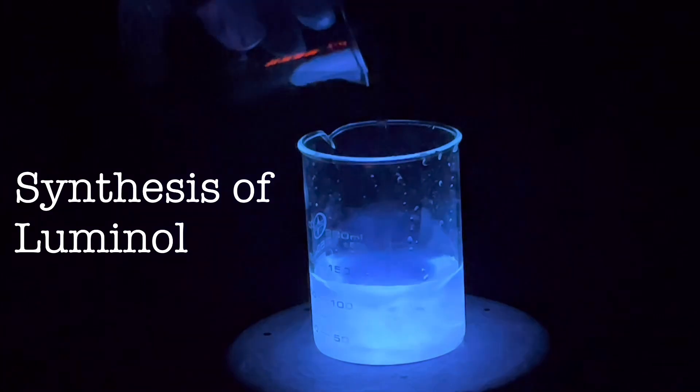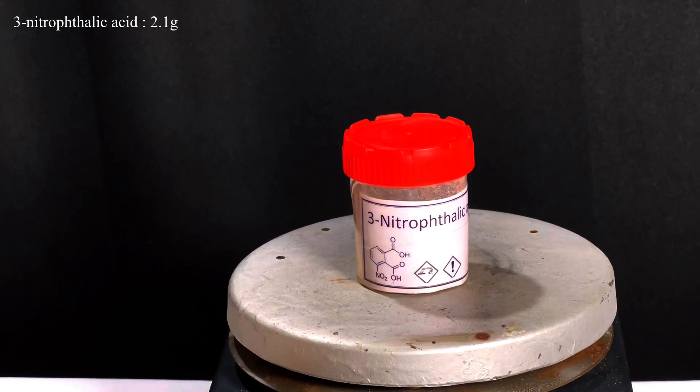Hello friends, in this video we will synthesize luminol and demonstrate its property of chemiluminescence. For this experiment, we will need 2.1 grams of 3-nitrophthalic acid, the synthesis which is included in a previous video.